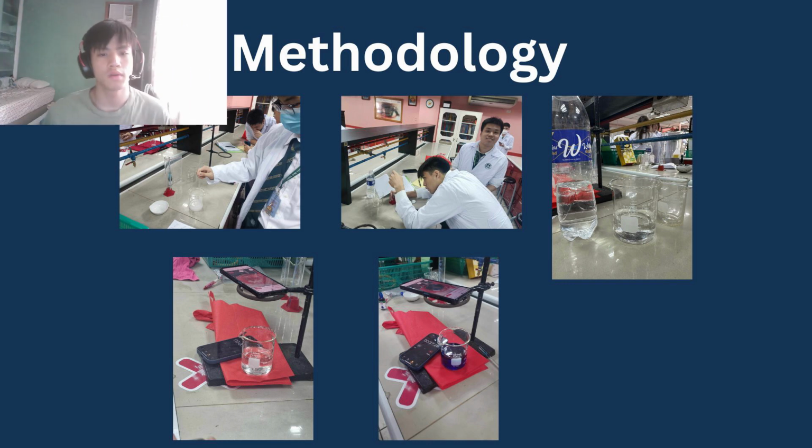The subsequent step involves filling another clear beaker with 100 milliliters of distilled water. Following this, using a 10 milliliter graduated cylinder, 10 milliliters is extracted from the 100 milliliters of the 1 mole sodium carbonate solution prepared earlier. Then, using another 10 milliliter graduated cylinder, 10 milliliters of 3% hydrogen peroxide is measured out.